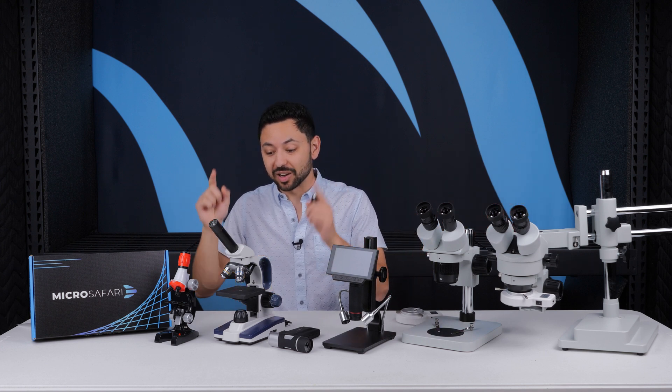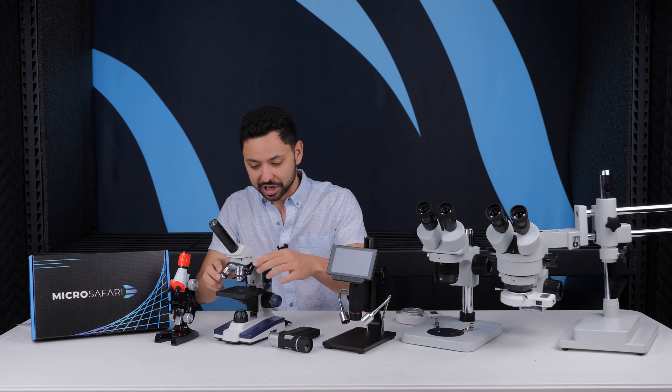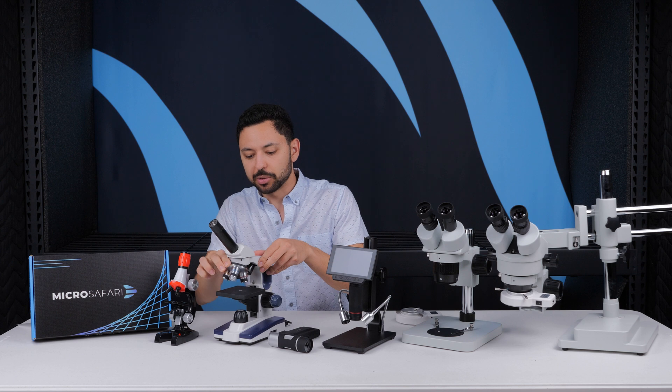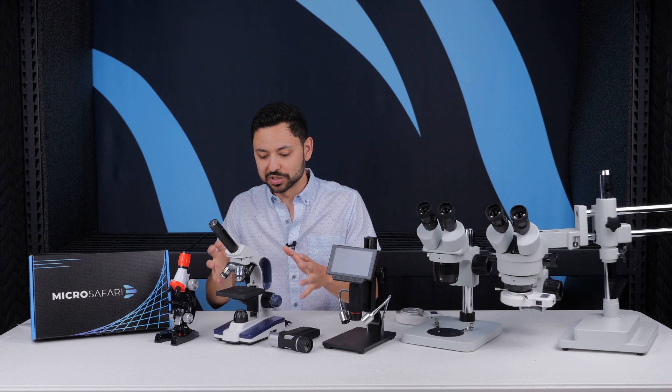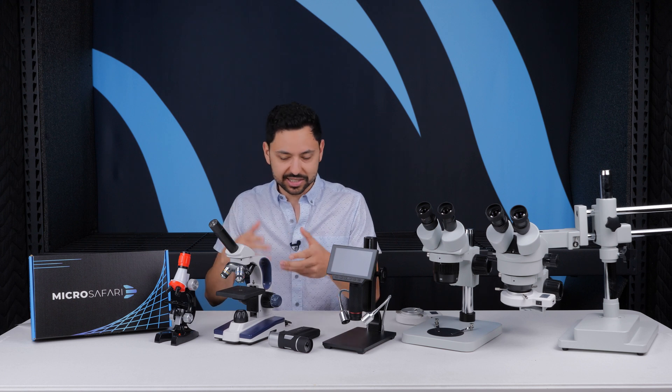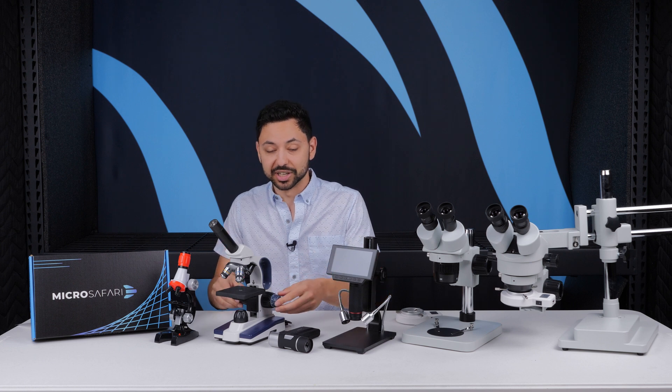I do not recommend that you get a compound biological microscope—the kind that has multiple objectives that you can flip down. The biggest problem is that the magnification is just too high, and it's very fiddly to get samples to actually work on these things. You need a glass slide, a cover slip, all of that stuff, which kids are going to have a really hard time doing, especially the younger kids.